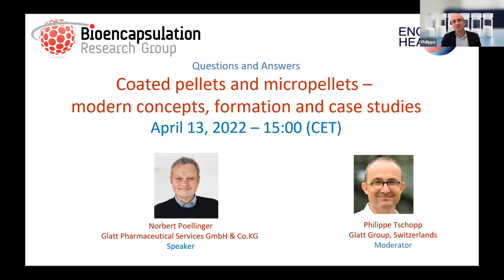Okay. And I assume that also instead of spray drying, spray granulation to achieve larger granules that can potentially be directly compressed would also be an alternative, right? Right. So in this presentation, we focused more or less on the spherical particles. But as Philippe said, we cannot only produce spherical and small particles with these technologies, but it's also possible, and this is even simpler, to prepare agglomerates, which may be compressed to tablets.